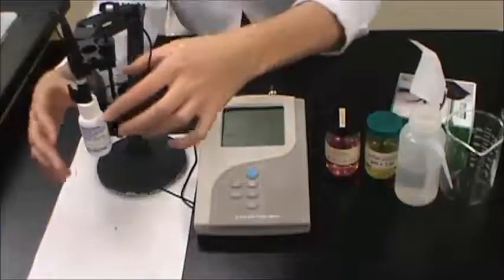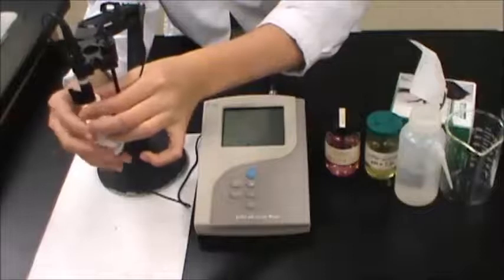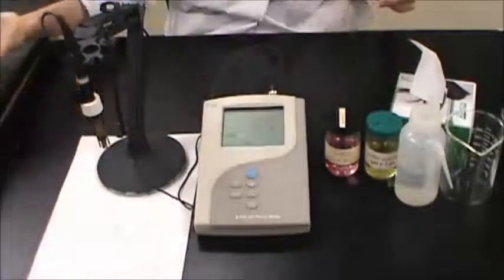Remove the bottle of electrode storage solution from the end of the pH probe and rinse both probes with deionized water. Then blot them dry with a kim wipe.